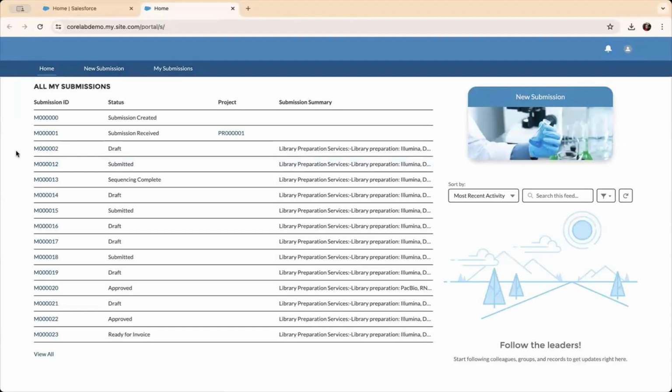account has created. So if you have maybe a PI who has several research assistants, they could see the same set of information. All of that can be associated to an account, or you can do it individually, depending on what your needs are.